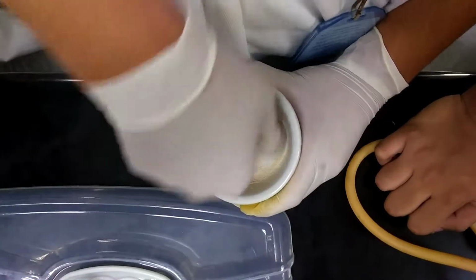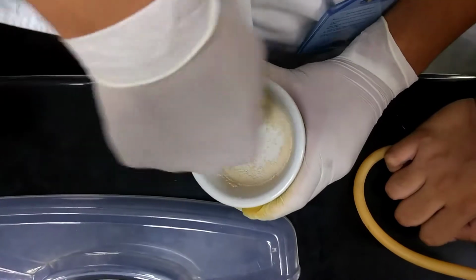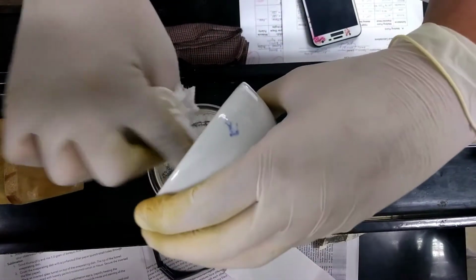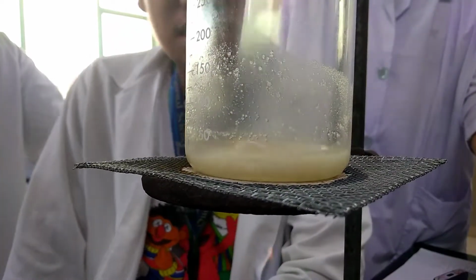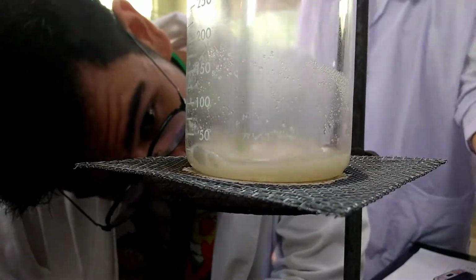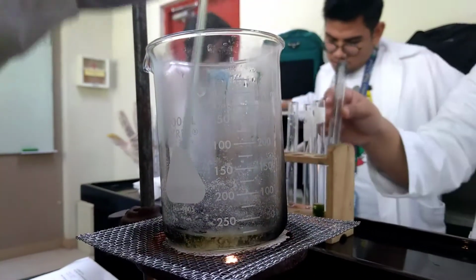Step 1. Mix 1 gram benzoic acid and 1 gram brown sugar in a mortar. Transfer the mixture into a beaker. Step 2. Add 20 milliliters of water, heat, and stir. Step 3. Once the mixture is fully dissolved in water, add a pinch of bone black and boil for 5 minutes. Step 4. Filter the mixture while hot using filter paper.